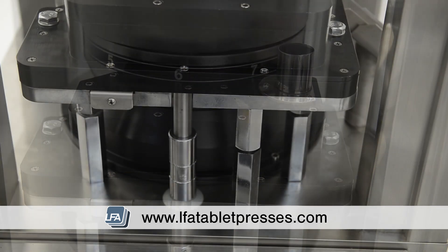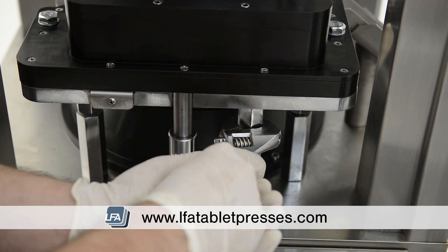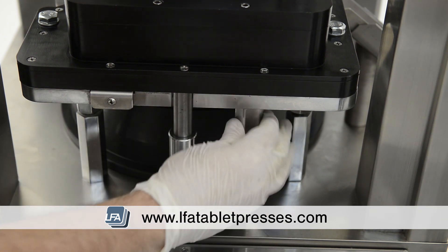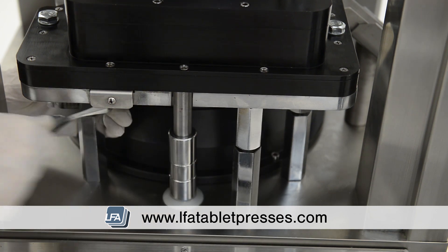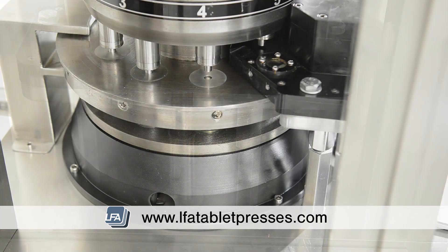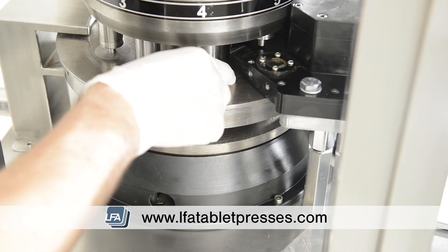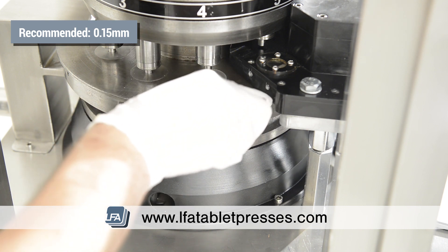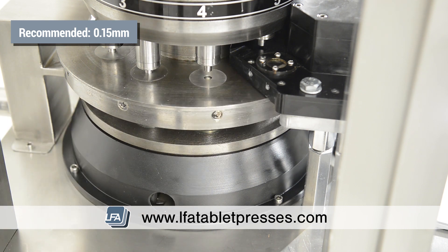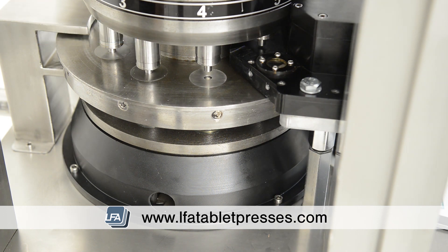Using an adjustable wrench we can now make final adjustments with the force feeder on if needed. Using feeler gauges you can measure your force feeder calibration. We recommend starting at 0.15mm — it will feel tight, but the feeler gauge should be able to still pass under. If you still find too much formulation on your turret table, then you may choose to reduce that further.